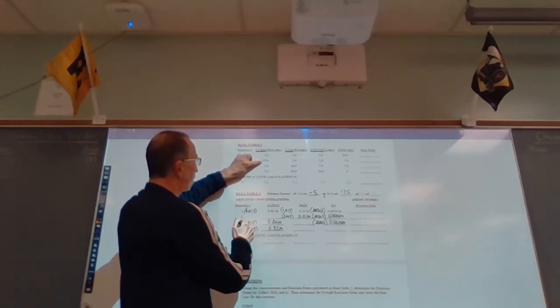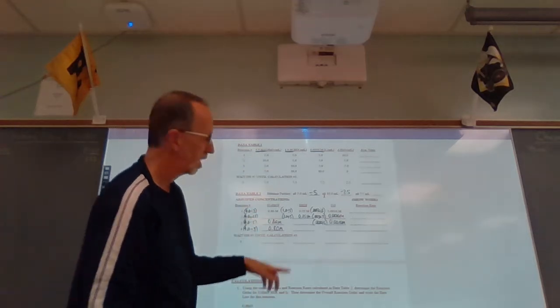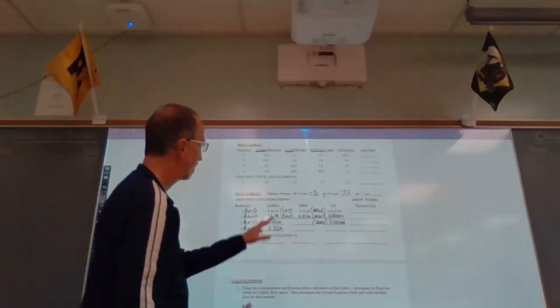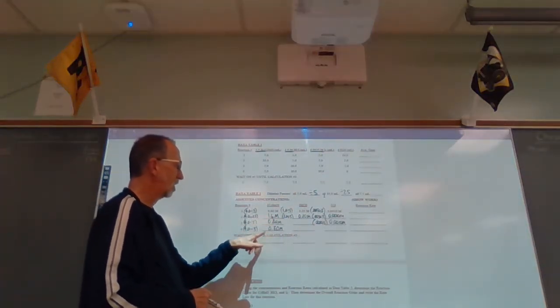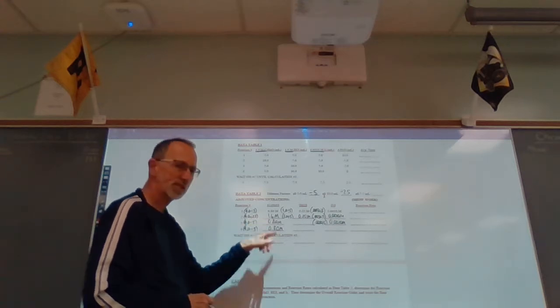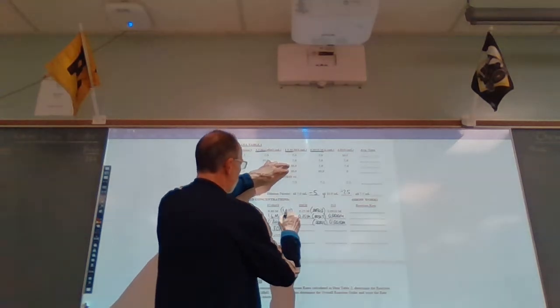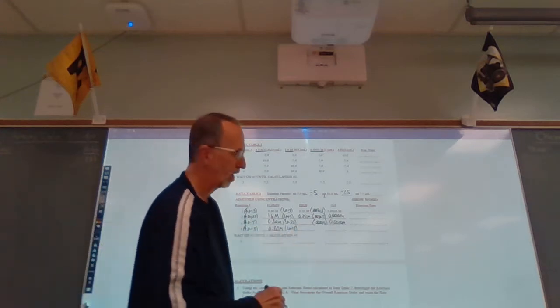So here we take our original concentration and divide it by 2.5, which gives us 1.6 molar. These are all 2 sig figs, by the way, based on our concentration. Which makes sense. This is double this because we diluted this by half as much as we did the 5 mL ones. These two are also both 10, so we would take our 1.0 molar and divide by 2.5 for both of these. And so these come out to be 0.40 molar.